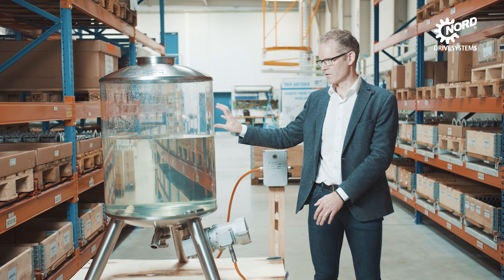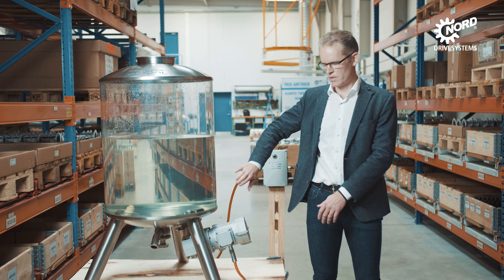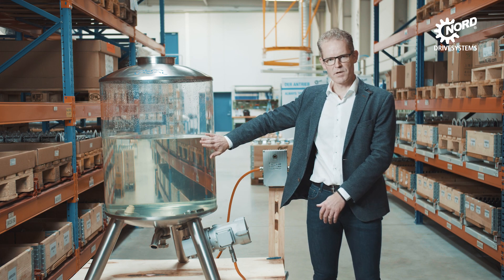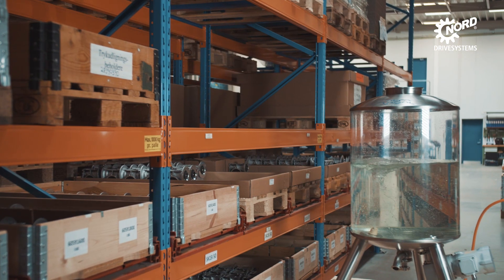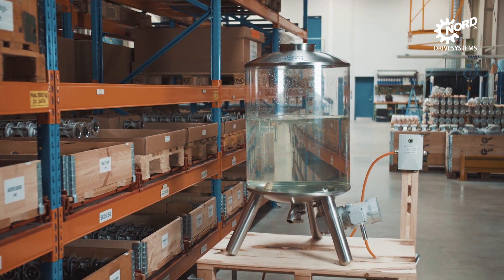This vessel is made of acrylic, but in the real world it would be all stainless steel, so that we have a mixer that can mix something inside the vessel in a sterile environment, completely protected from the outside, more polluted environment.